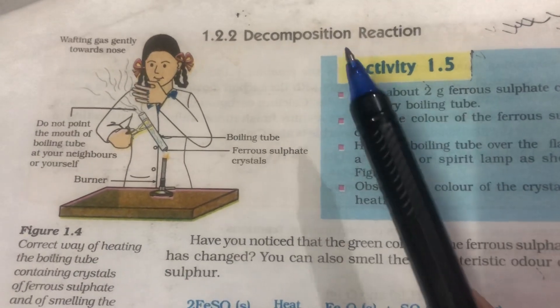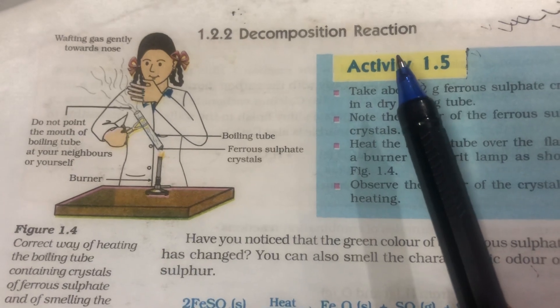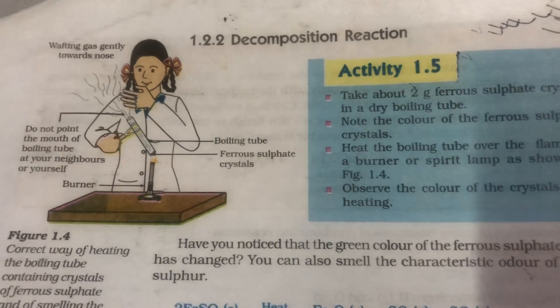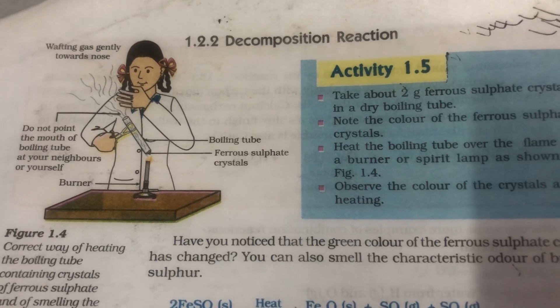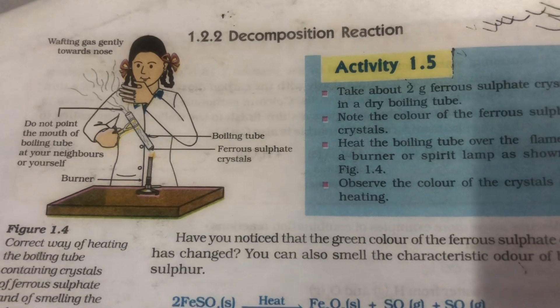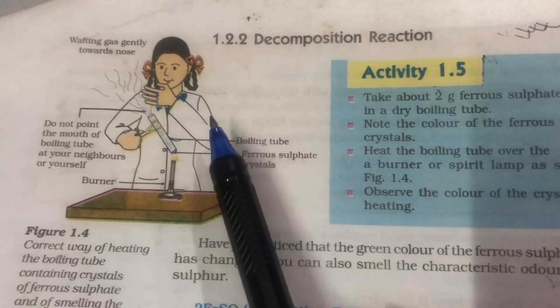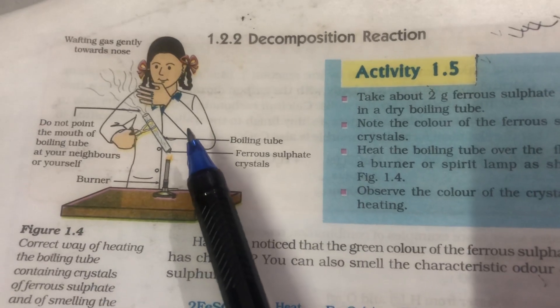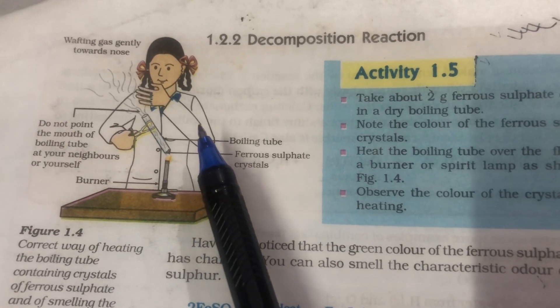An activity on thermal decomposition of ferrous sulphate crystals. Ferrous sulphate crystals are green in colour, and as you take them in the test tube and start heating them, what precautions are to be taken you can see from the diagram. As you can see, the mouth of the test tube is kept away from the observer.